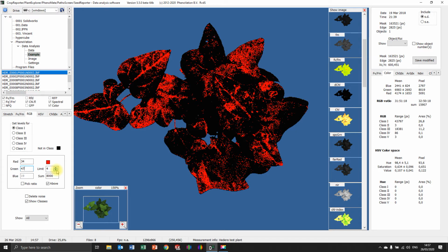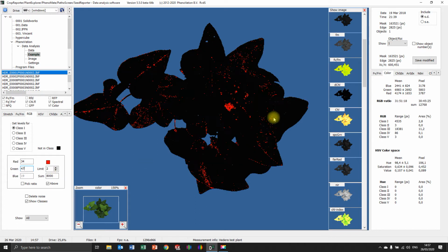We can check out what it would do, because with 3 you can see the spot we labeled, but also other things. You see 1 is a little bit less, because then this will also disappear. So we'll take 2, but we have a different possibility.